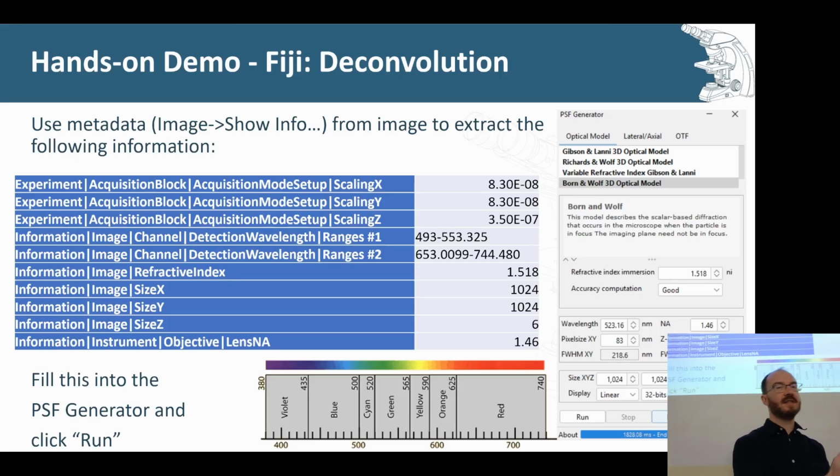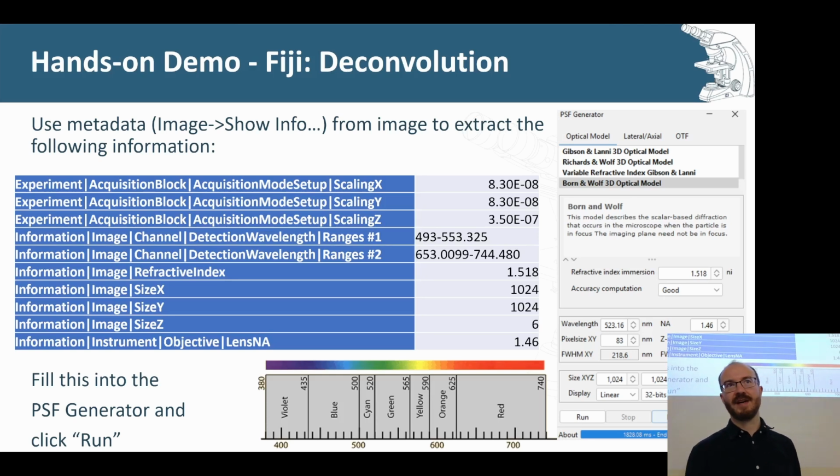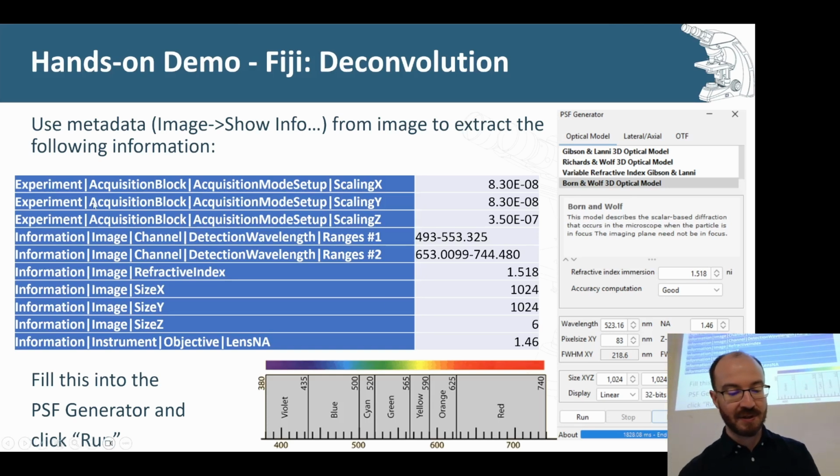Yeah, you would just do one channel at a time. You could technically do them in parallel, but it will be a macro, as Elisa was saying. This point spread function generator, you can't really do with a macro. I haven't found a way to call this PSF generator from a macro. I can extract all of these values if I know what the names are here.